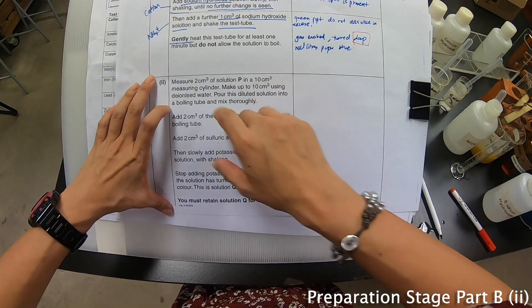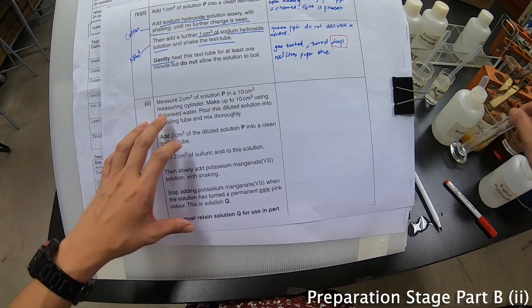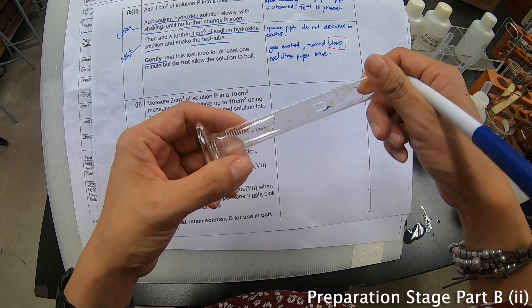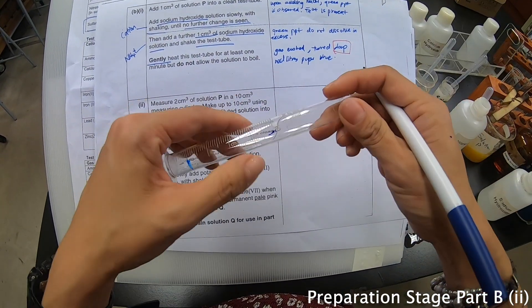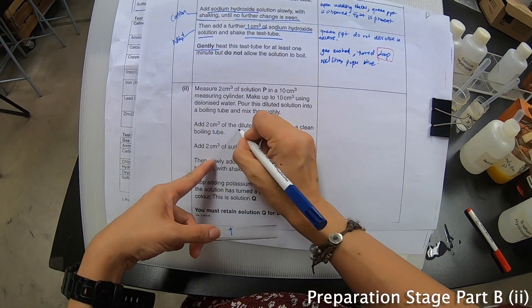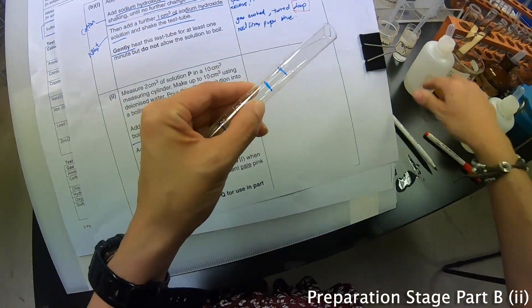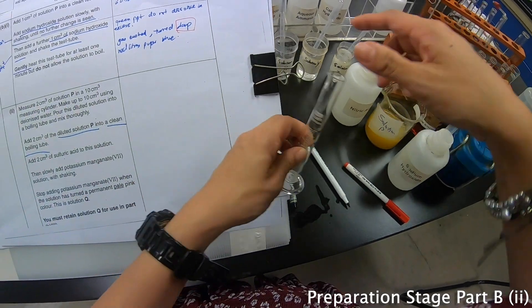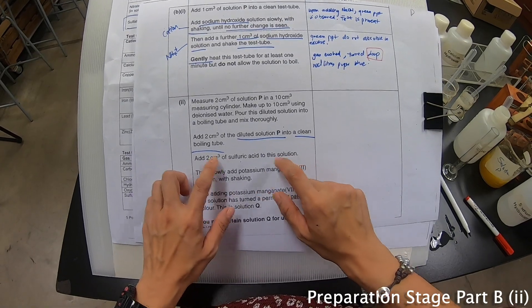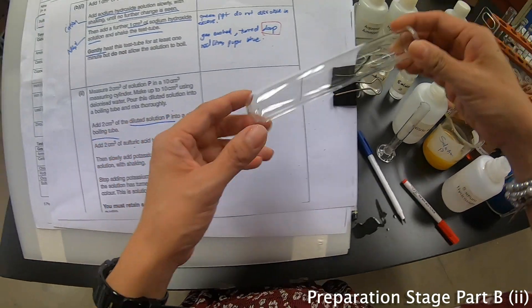Now they say: measure 2 cm³ of solution P in a 10 cm³ measuring cylinder and make up to 10 cm³. Then pour another 2 cm³ of the diluted solution into a clean boiling tube — which means from 10 cm³ you reduce to 8. Then they go on to say: add about 2 cm³ of sulfuric acid to this solution.